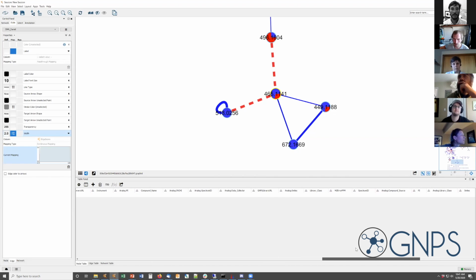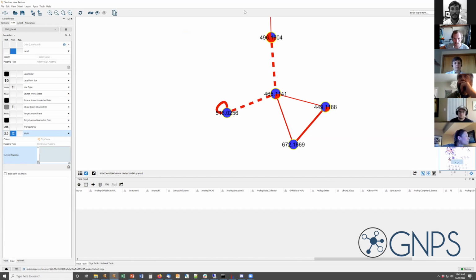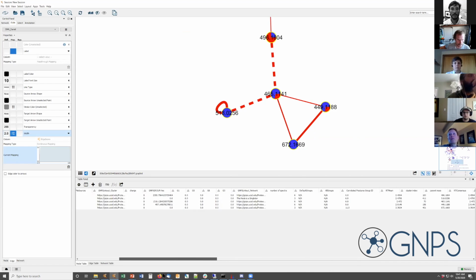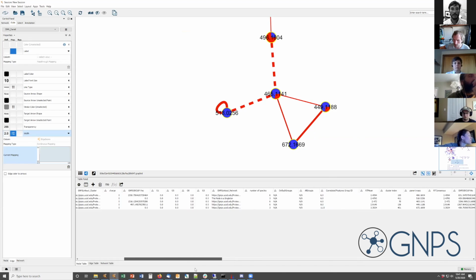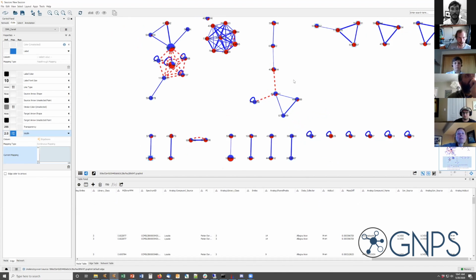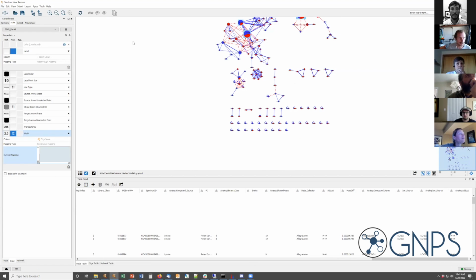Does not seem to have an annotation. But now I could look at the surrounding nodes, right? Like select all of them and see, oh, maybe my library was actually biased towards the protonated species, and see if the M+H version has a library ID, but in this case, actually none of those had one.